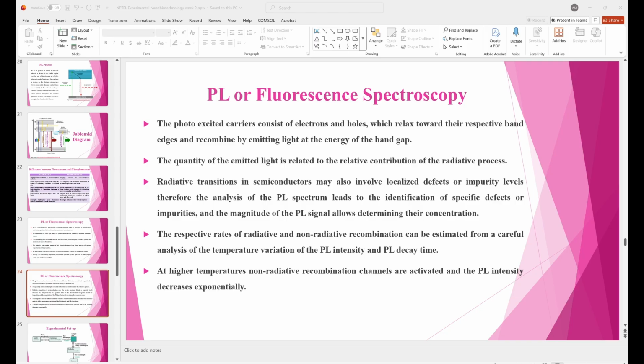However, for fluorescence spectroscopy, you can see the setup here. In fluorescence spectroscopy, the detector is at 90 degree. Why? Because you can see your light source is here, with many wavelengths, and an excitation monochromator. The excitation monochromator will select a particular wavelength which will excite your sample. Your sample cell is here. So this is your lambda excitation, one wavelength selected by the excitation monochromator. Then the luminescence or fluorescence will be at many wavelengths. You have an emission monochromator here, which will select a particular wavelength. That is your lambda emission, and then your detector will detect it.